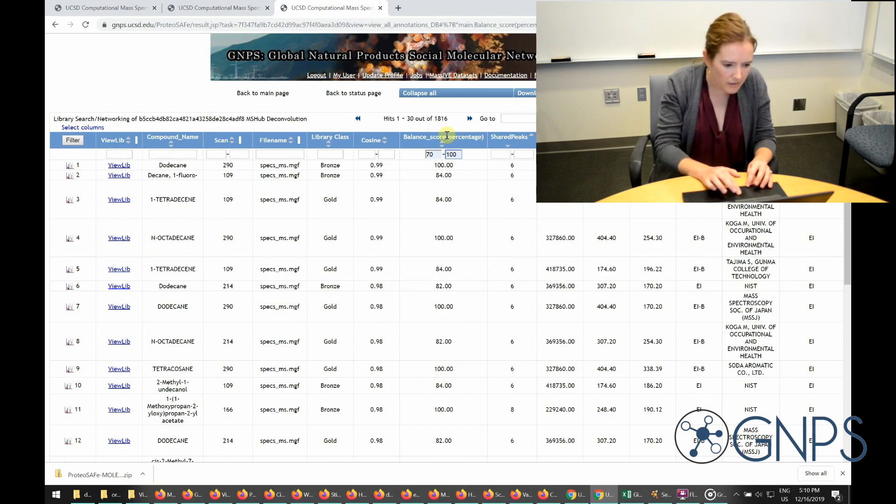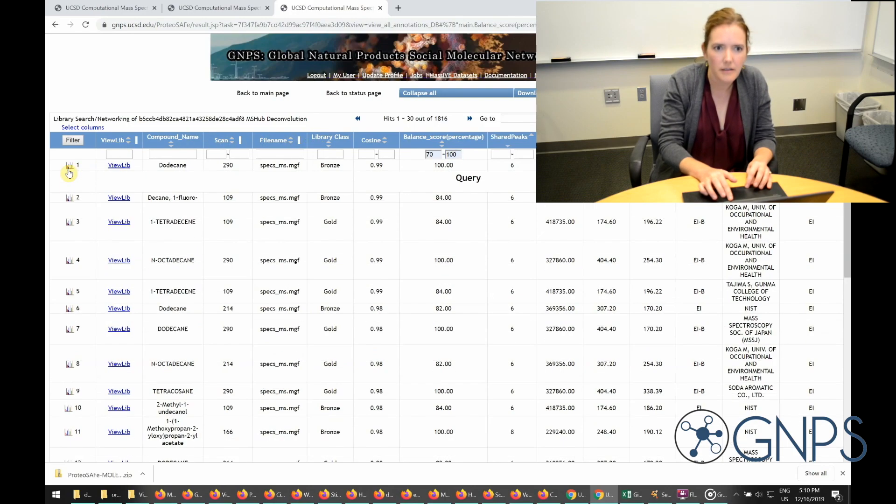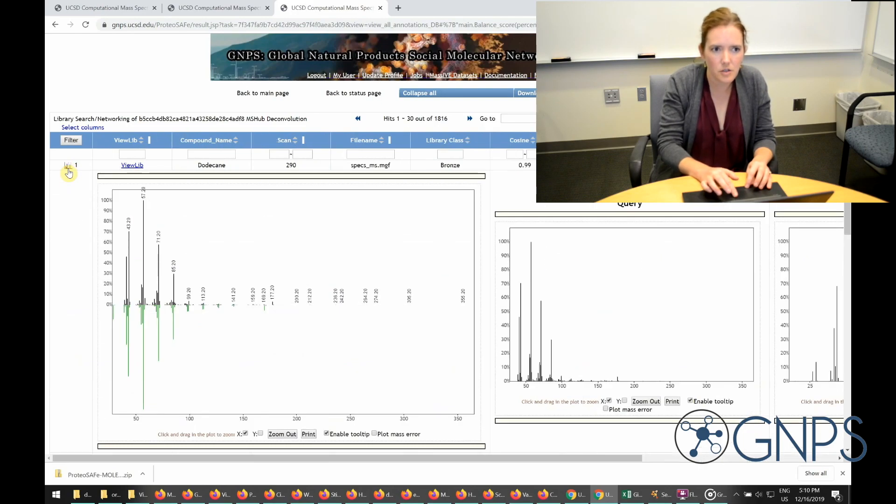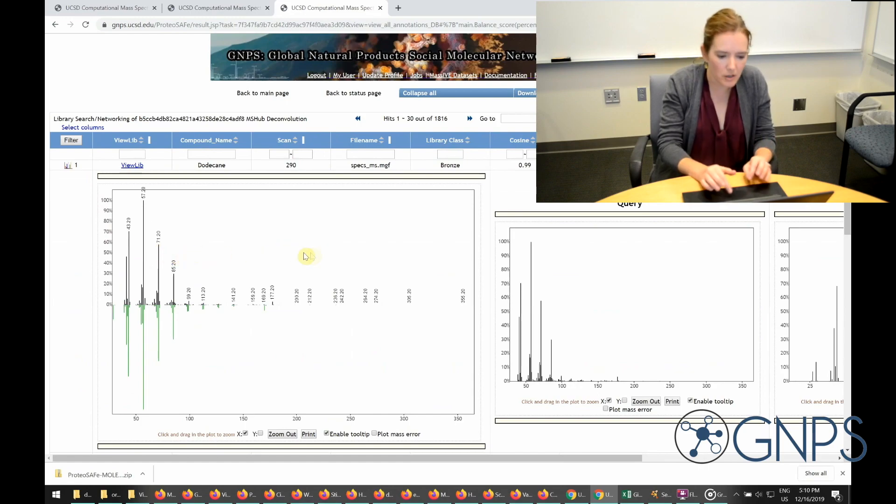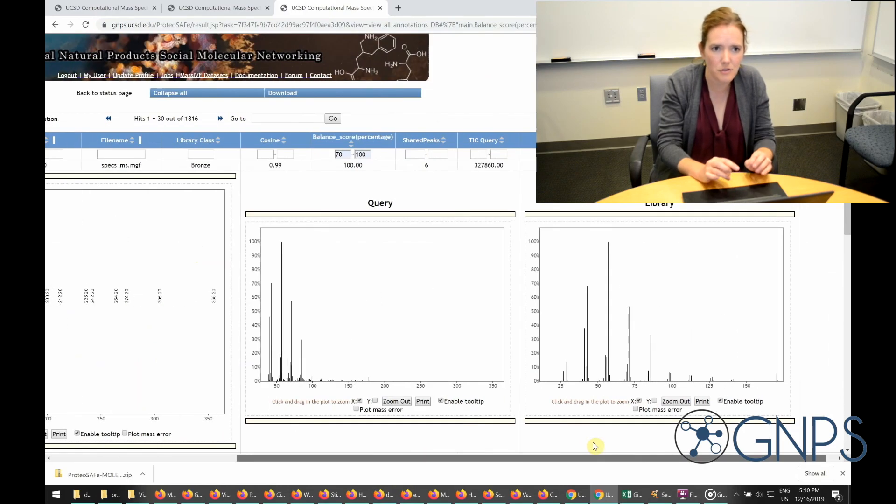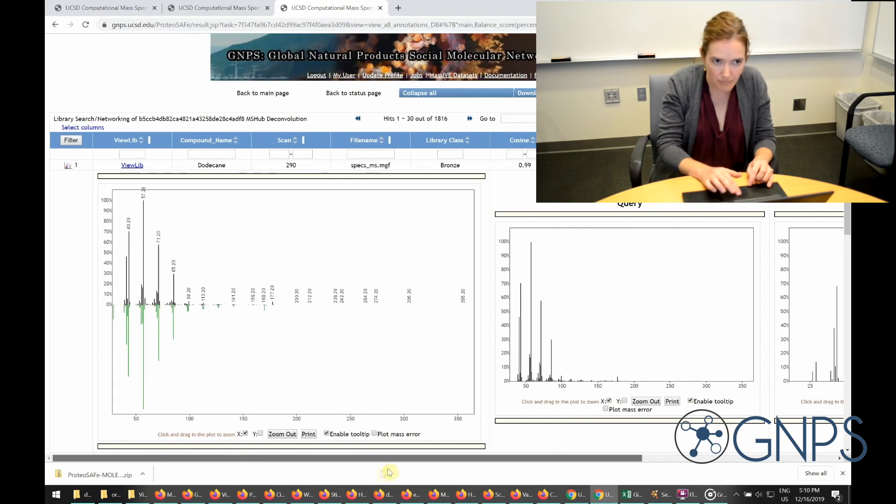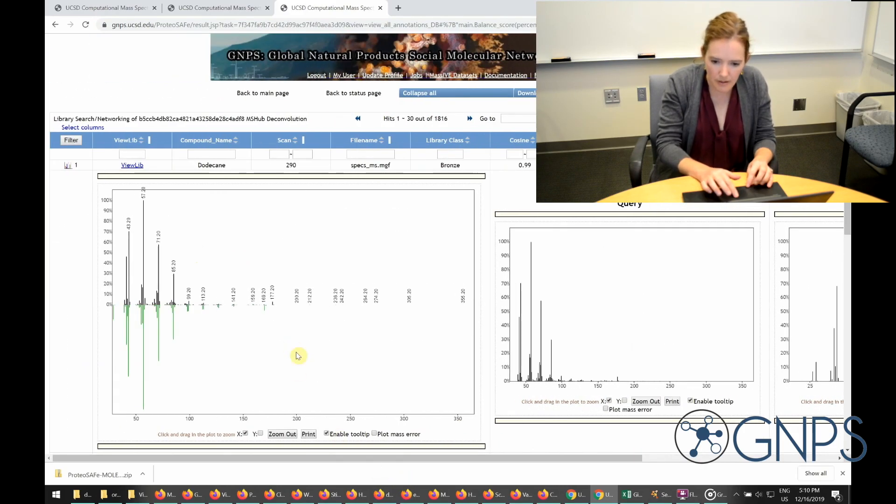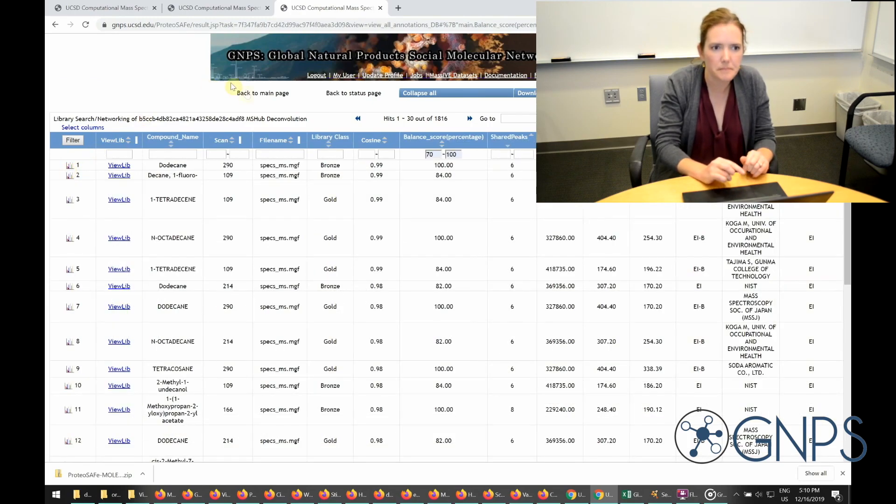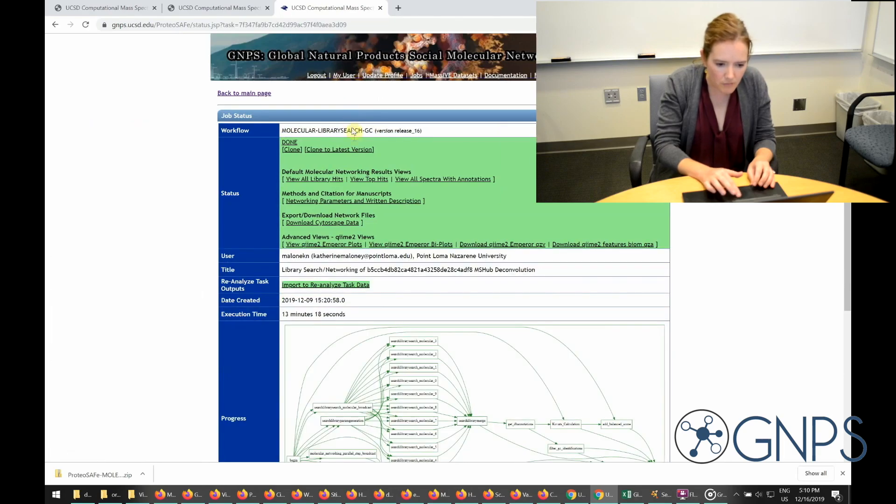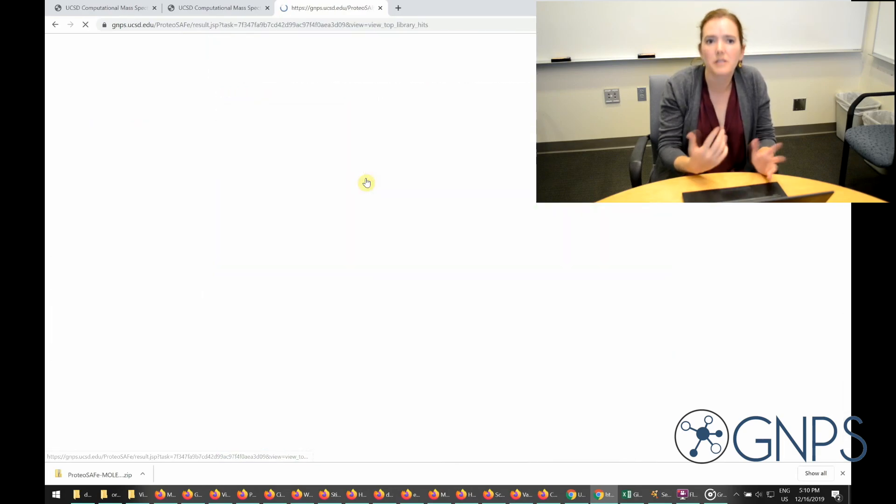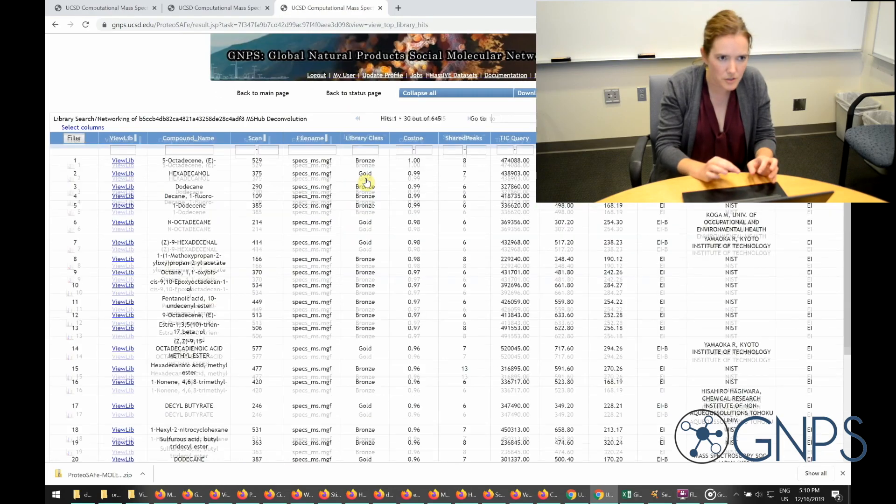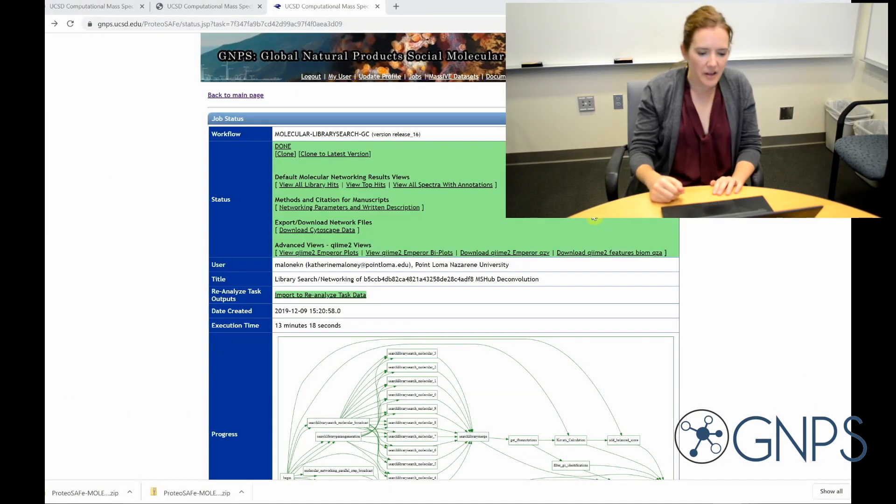If I click on this icon over here, it's going to give me a mirror plot. So this is going to show me both my query spectrum and the library spectrum. And you can see here that this one looks like a pretty nice match. If I want to return to the job page, I can just click here. And view top hits is similar, but it's only going to return the top library match for each of my compounds.